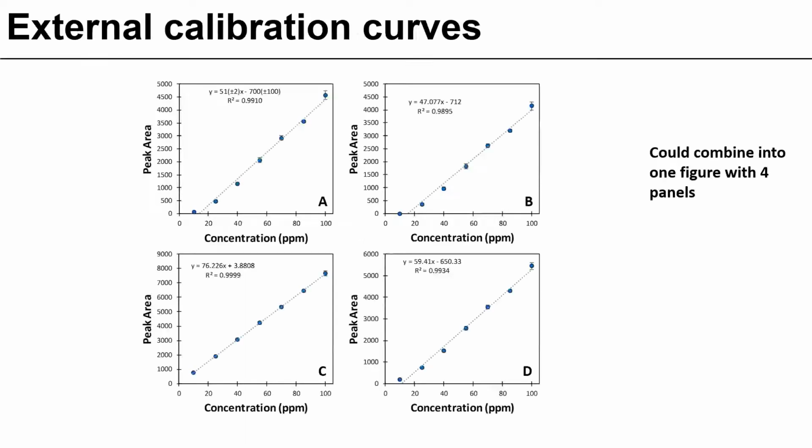All right, so let's move on and talk about calibration and validation. So external calibration curves, you're going to create 4 external calibration curves for the experiment, right? Because you've got 4 different analytes, and each one of those is going to have a different response factor. So you guys are very familiar with this at this point. Creating external calibration curves should be second nature.